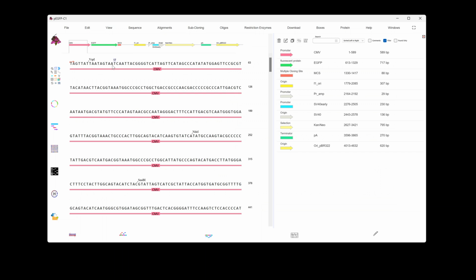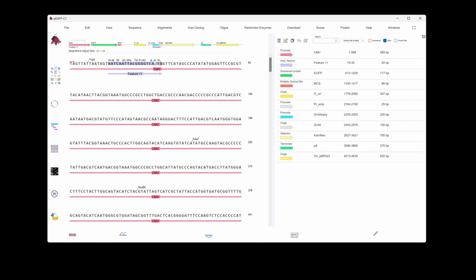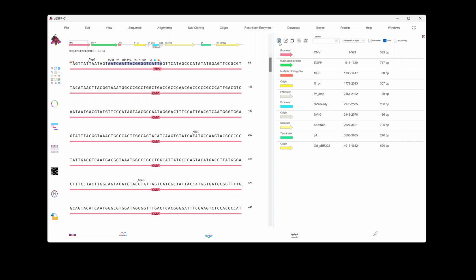It's easy to create new annotations by selecting the relevant sequence and pressing the blue arrow shortcut above the selection. The new instant annotation is listed in the annotation box in the right panel. We can select it, and for example choose to copy, edit, transfer, or in this case, delete it. You can also interact with annotations directly on the sequence by invoking their pop-up menu.